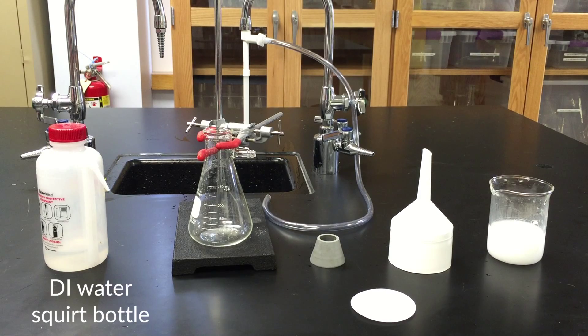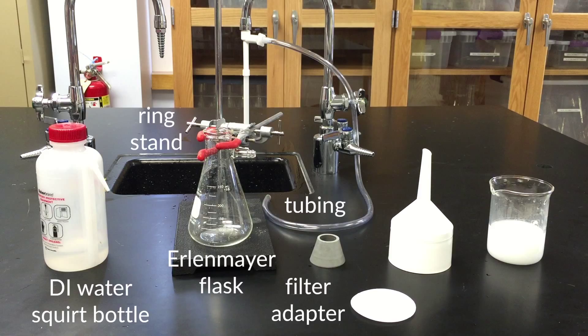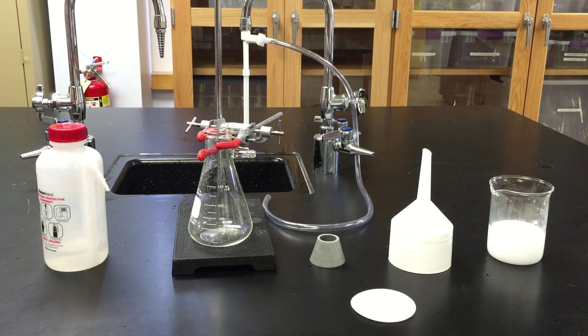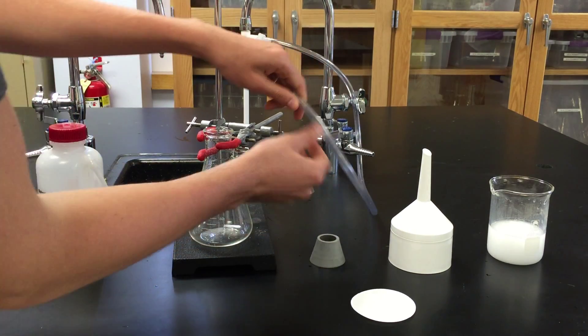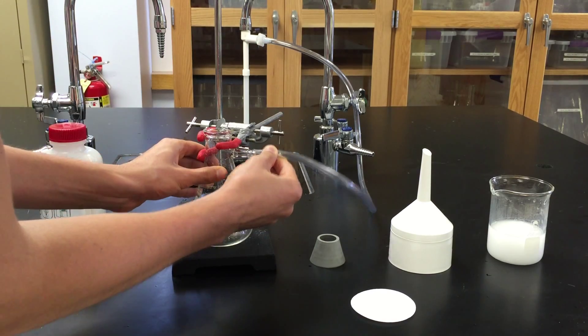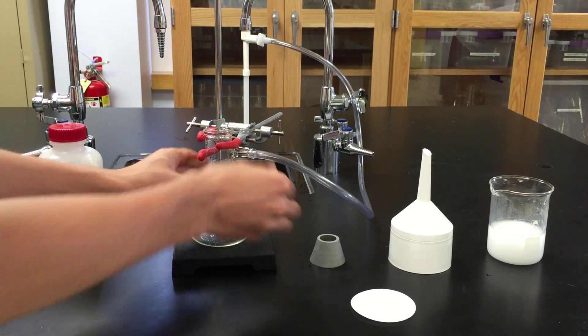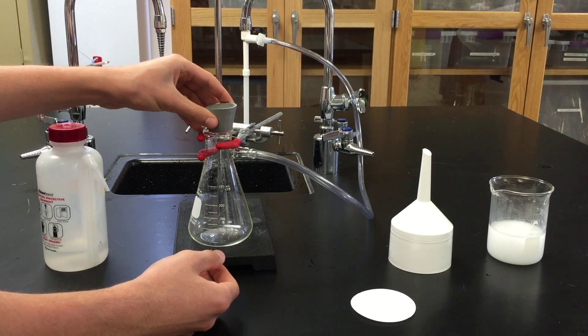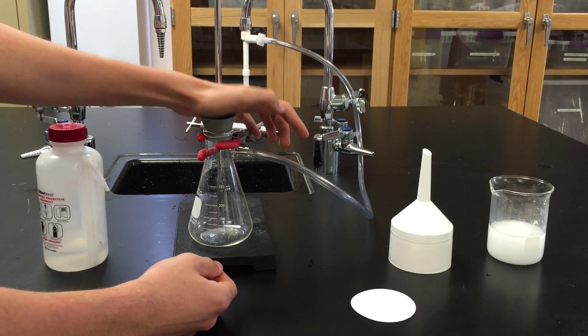For a filtration, you need water, a ring stand, a sidearm Erlenmeyer, tubing, a filter adapter, filter paper, a Buechner funnel, and your solution. First attach your tubing to the arm of the Erlenmeyer flask. Then place the filter adapter in the top of the flask and put the funnel on top of that.